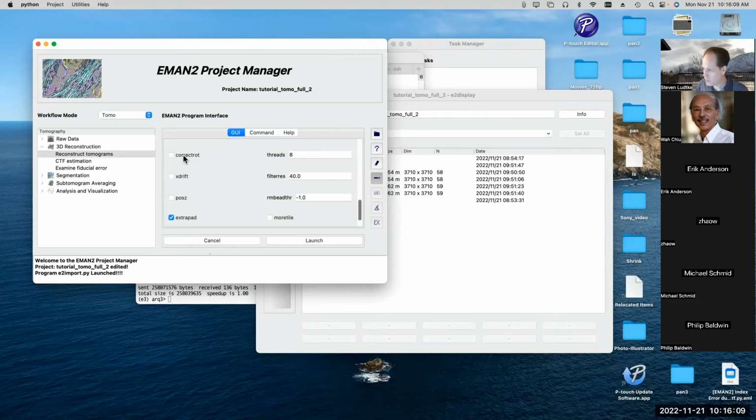So if you reconstruct single particle style data and you find that the tomogram isn't flat, so as you move up and down through the tomogram, you see these patches which sort of slide across because the physical specimen was tilted with respect to the XY plane, correct rot will try and flatten that out, so all your particles more or less lie in the same plane.